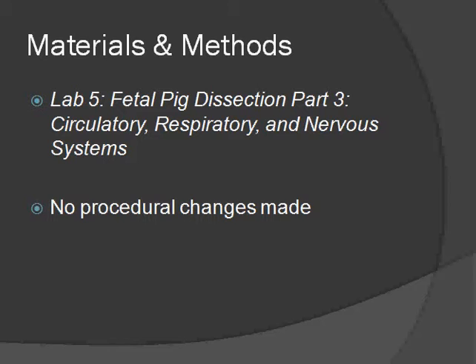Concerning our materials and methods, Lab 5 was completed according to the Fetal Pig Dissection Part 3, Circulatory, Respiratory, and Nervous Systems procedure, provided by M. Buchholz and found in Worcester Polytechnic Institute. No procedural changes were made during the completion of this experiment.